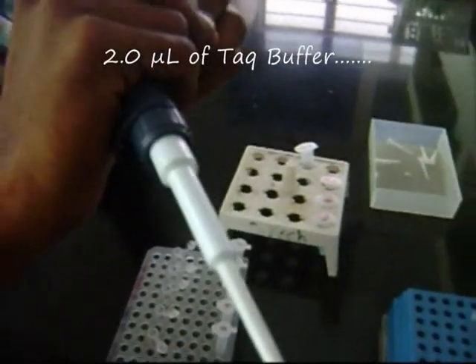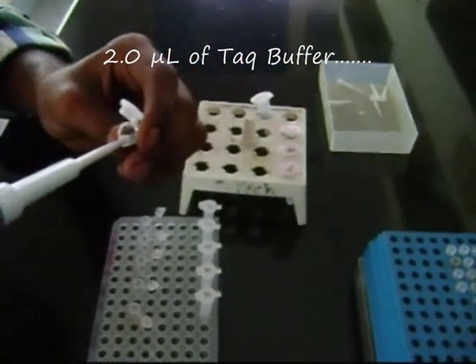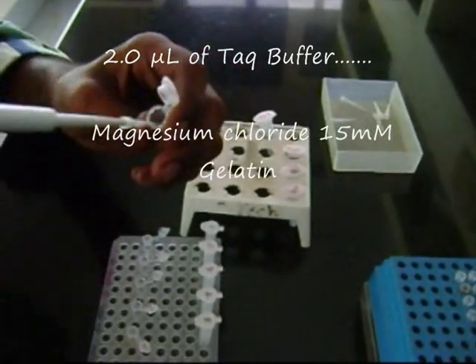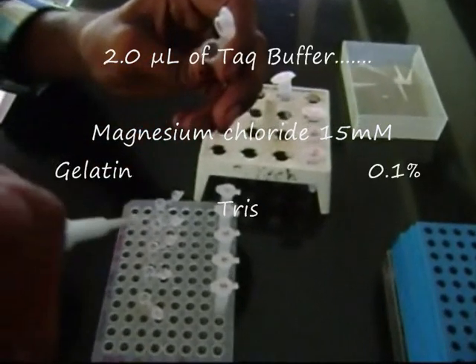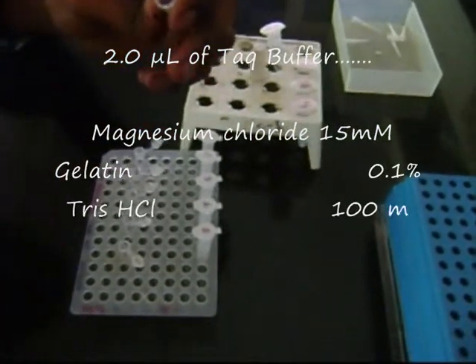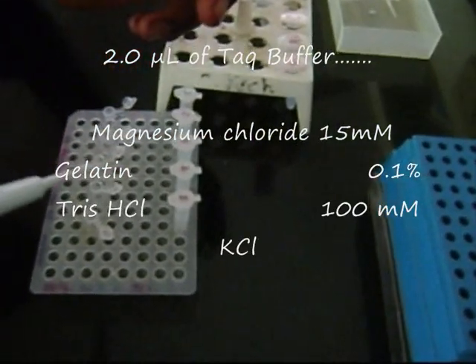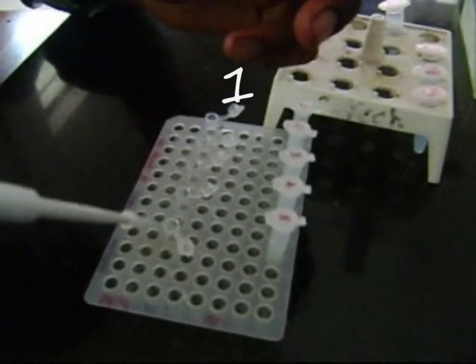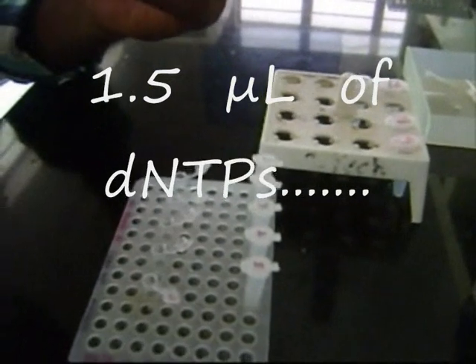2 microliter of PCR buffer is added. It consists of magnesium chloride, which provides magnesium ions that act as a cofactor for DNA polymerase.